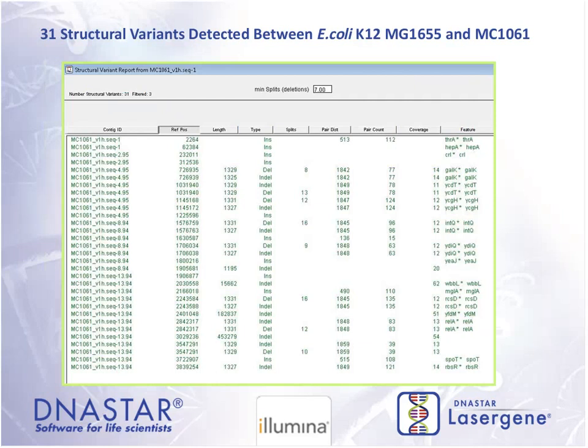But this is just a screenshot of our structural variation report, and it shows me the reference position, the type, whether it is an insertion or deletion, and we just see the count here in the upper left corner that we have 31 structural variations. And so that just gives us an idea of how close these genomes actually are. If I had 300 structural variations, I would reconsider my reference sequence, or I might say, I'm going to look at my de novo assembly. Maybe that's the better route. So I get an idea. Here's my starting point. We have 31.